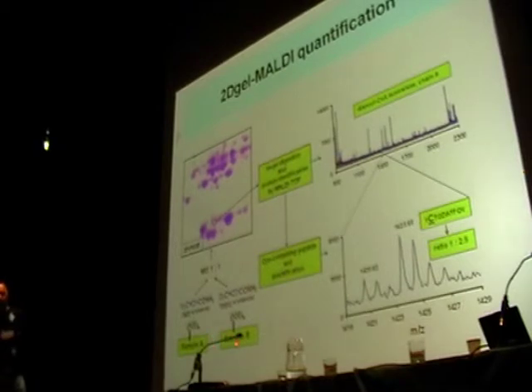It does not matter what you want to compare, like cells control and cells treated, or disease conditions versus control, or disease plus treatment versus disease no treatment. We're just talking about relative quantification between two samples.